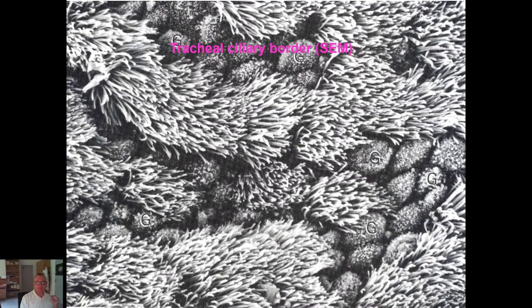And this is the picture from the scanning electron microscope. It is the inner surface of the trachea, at quite small magnification, so we can see many processes, mostly cilia, but also microvilli. You will know them after the lecture about epithelial tissue.